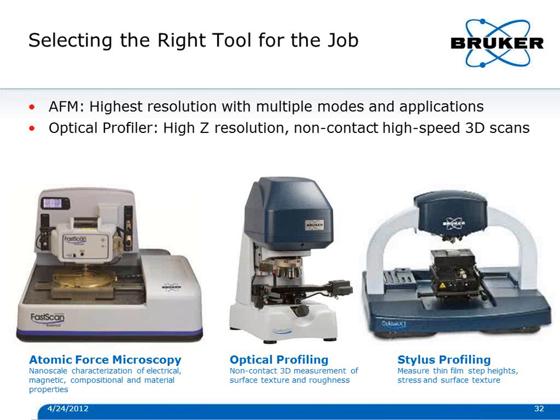Optical profilers are, again, a non-contact method, so there's never an issue with scratching the surface or having to be concerned with that. But it doesn't give you the same resolution as the AFM. The big advantage of the optical profilers is speed. It gives you very, very fast 3D images that you can collect very quickly, and you can even stitch together multiple images to look at a very large area. With the optical microscope, you may have a very high magnification objective that only looks at a very small area, but if you want the highest resolution, you can stitch together multiple images and create one large 3D map.